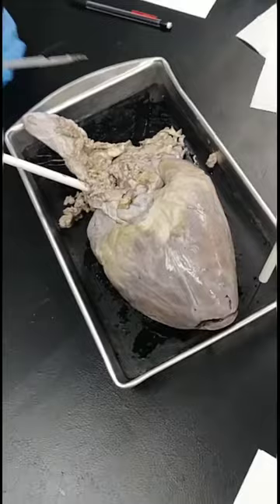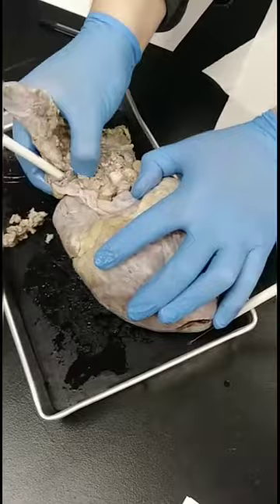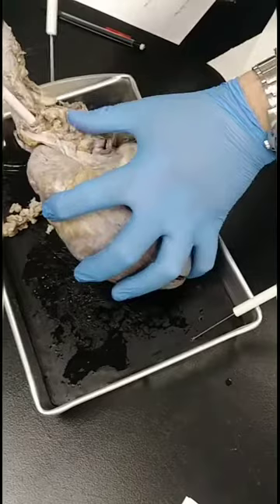Okay. Oh, look at that. Good. So you exposed something else down here. They gave you a lot more of the pulmonary trunk. Last year, this was mostly cut off, so I'm glad they have more for you guys to look at this year. So take one of your probes. Let's mark what you just uncovered there.